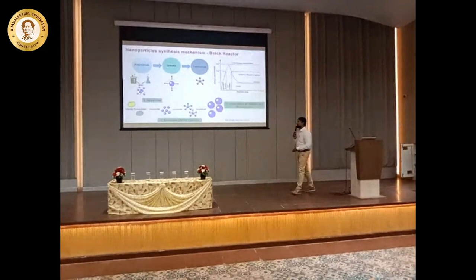So we take the metal precursors, say gold. I take some reducing agent, I start forming these nanoparticles, and then I stop this coalescence. See, the metal precursor is slowly becoming a particle. So now a molecule converts into a nanostructure, and this nanostructure growth will stop either by modifying or changing the concentration, or by changing the surfactants, or adding some surfactants to it.